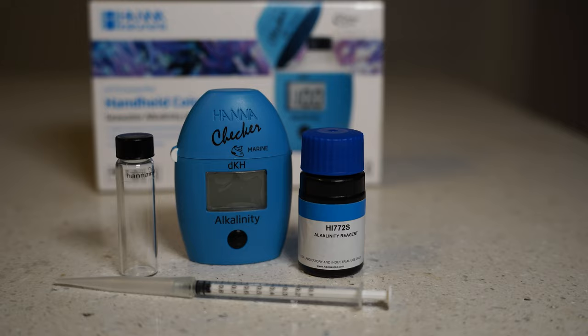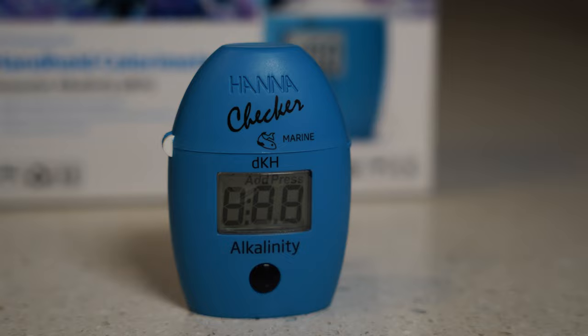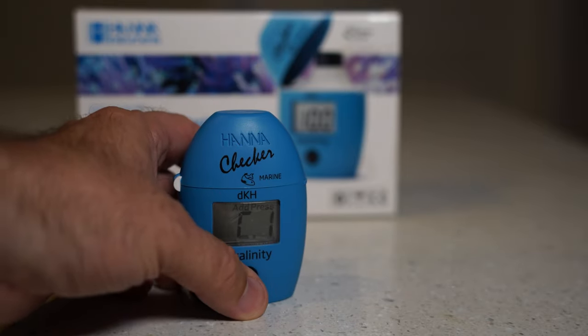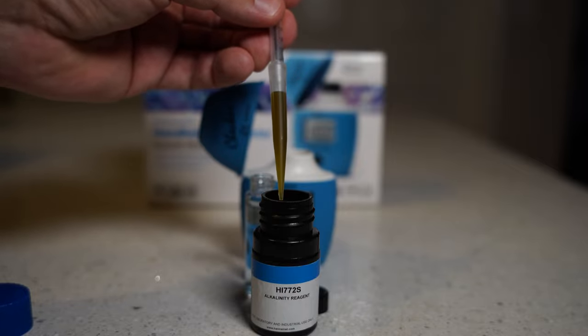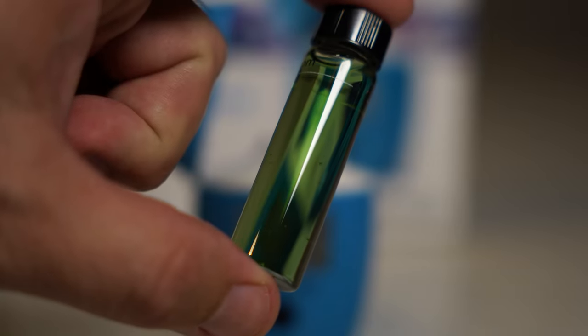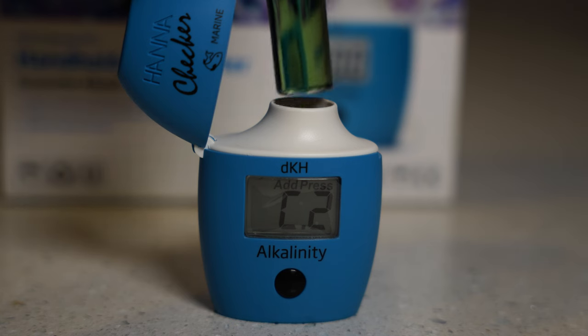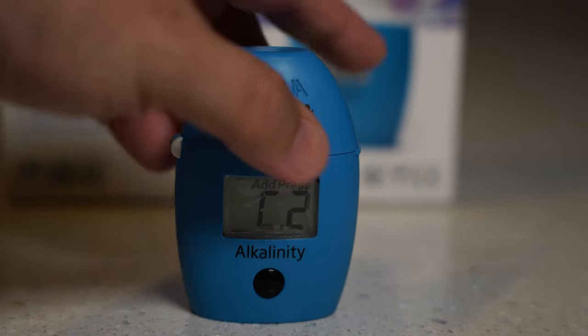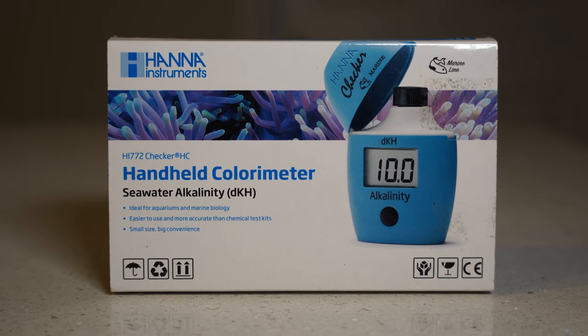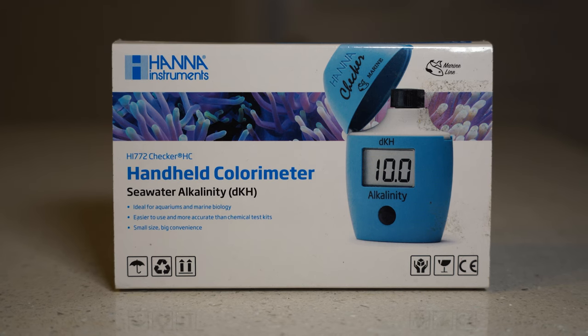Let's test alkalinity first with the Hanna Checker. Turn on the unit and wait for it to display C1. Fill it with 10 milliliters of saltwater from the aquarium and put it into the tester. Push the button again and it will display C2. Take the syringe, fill up one milliliter of the reagent, and add that to the saltwater. Once you add that milliliter of reagent, gently flip it back and forth five times. Put it back in the checker and push the button — you don't hold it down like the previous checkers. My alkalinity is showing 9.1 dKH, which is a little higher than I want. At Worldwide Corals we like to be in the 8.3 to 8.9 range. Last week it was at 9.0, so I see it trending upward — I'm gonna slightly lower the amount the doser is putting out.